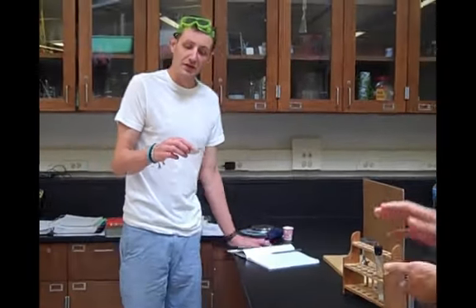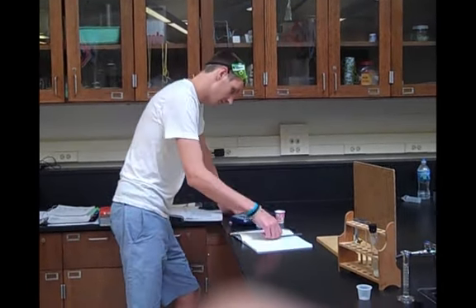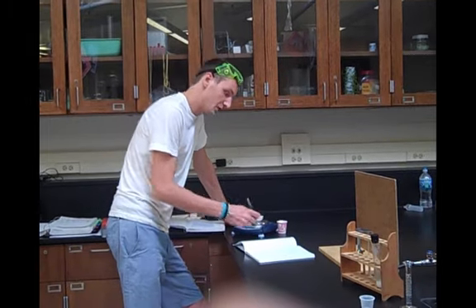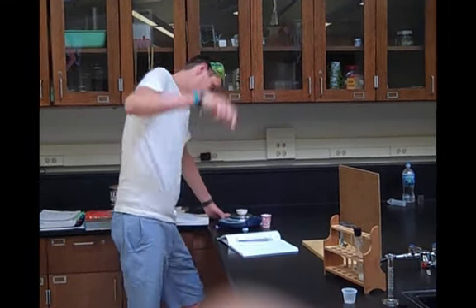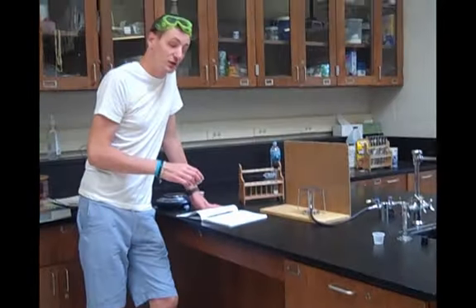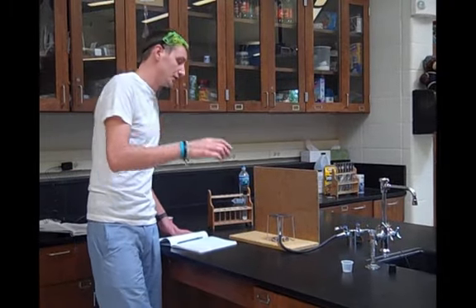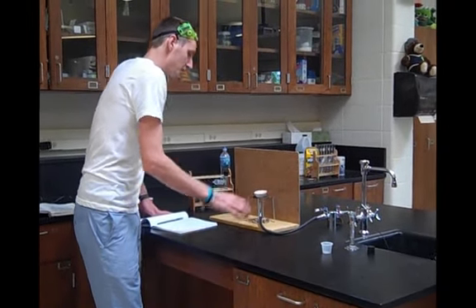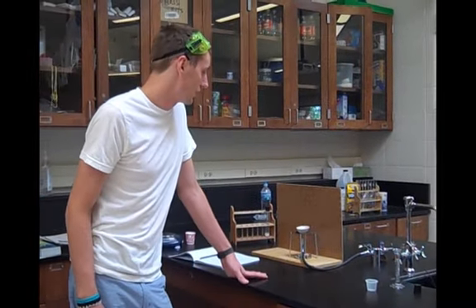Once you have your evaporating dish and your solution, you're going to mass it again. Make sure you record your mass. So once you've recorded the mass of your evaporating dish and solution, you're going to put it on your burner stand and evaporate the liquid in your solution.